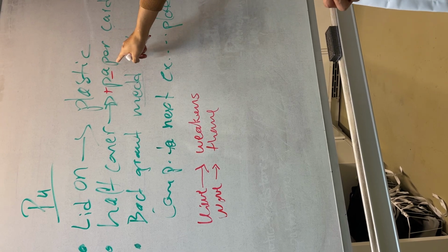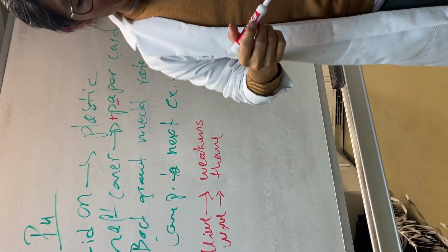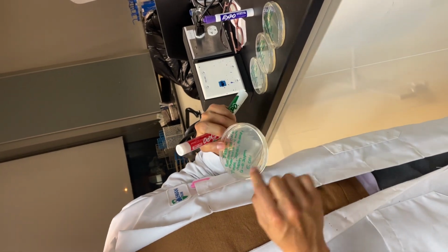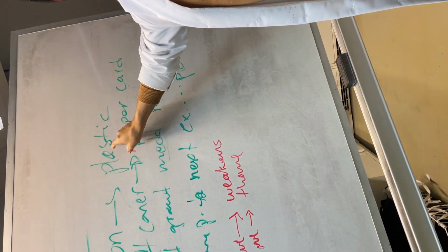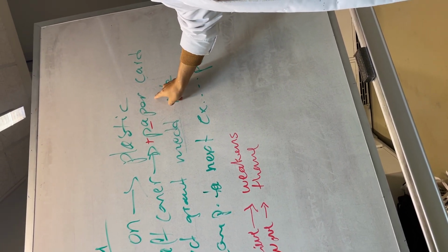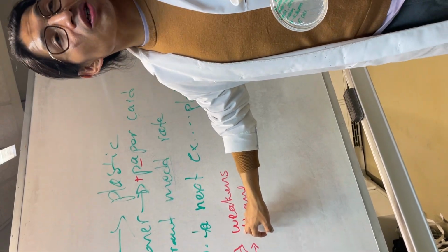And it doesn't matter if you cover it with paper or without paper. The effect will be equal, will be similar. Therefore, we see the growth of the colony equal across the board. There is no difference in the half that the paper was covering, because the major force protecting is actually the plastic, not necessarily the paper. The plastic is effective in reducing wavelength by itself, no matter what.